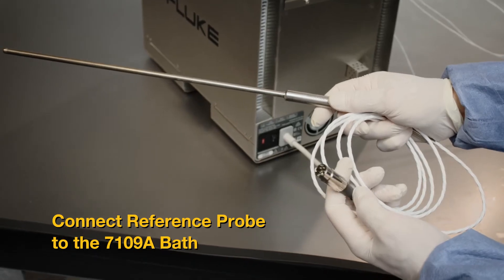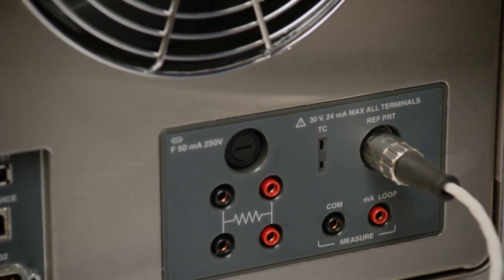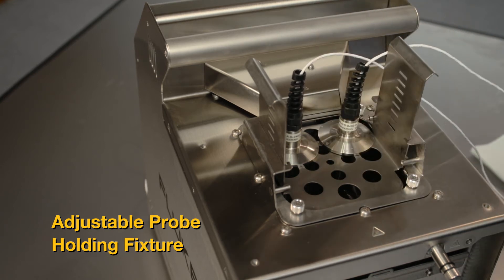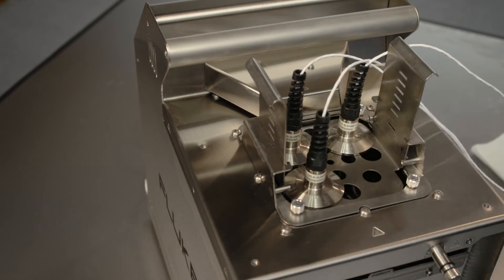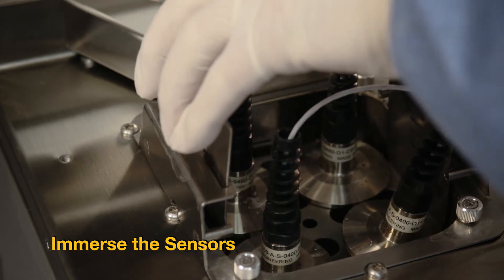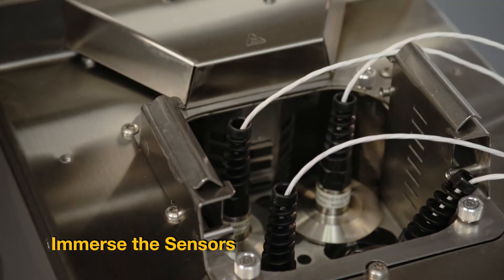Connect a secondary reference PRT to the reference PRT input of the bath. Use the optional adjustable probe holding fixture to hold up to four tri-clamp temperature sensors. The fixture fits inside the tank opening, and the height of the platform is adjustable. Immerse the tri-clamp sensors with the flanges just below the surface of the fluid.